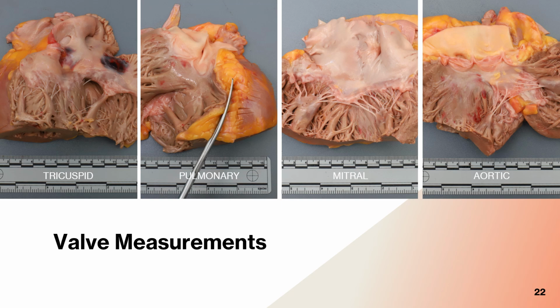We talked about this as we went through it. I would recommend that as you're going with flow of blood, you just measure as you go, but just a reminder that we do want the circumferences of all of the valves as well.